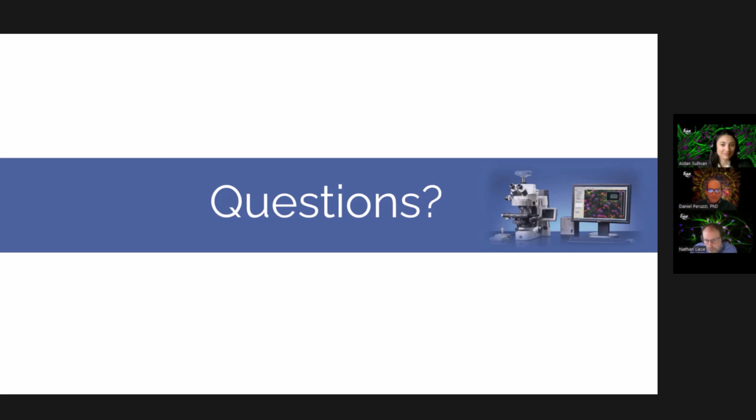All right, what do we have? Next question. Let me see. Are there rules between physical and optical dissector? No. I think it's saying, like, can you use the same guidelines for a pilot study for physical fractionator and other probes, maybe? Right. So the probes themselves would have different rules, but the pilot study would be the same idea. Shoot for 200 to 300 and take a look at your CE. Perfect. Let us know if we answered that question fully.